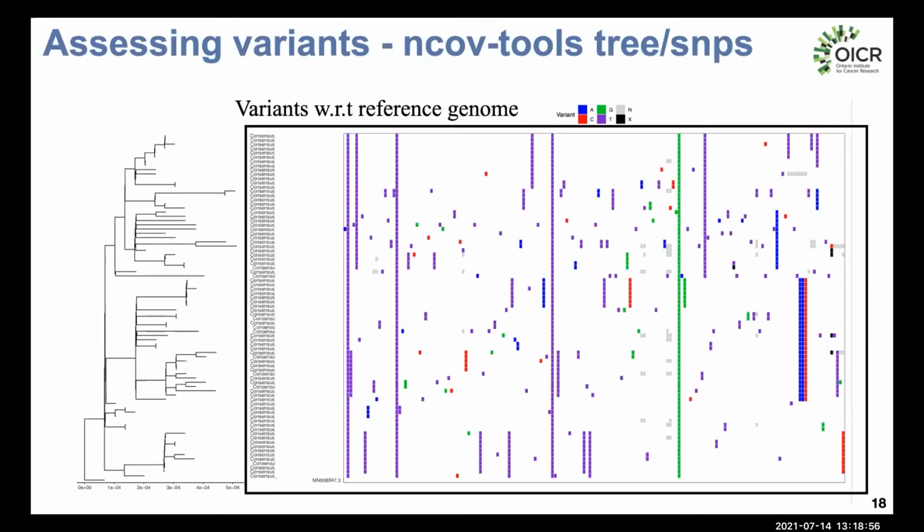Then we depict, with these colored boxes on this heat map-like diagram, all of the variation present within every sample on your sequencing run. Whenever you have a colored box, it means that a sample mismatched the reference genome, had a variant or a mutation at this position. These purple boxes that I'm showing with my mouse pointer show that every sample in our sequencing run had a T mismatch with respect to the reference genome at this position.